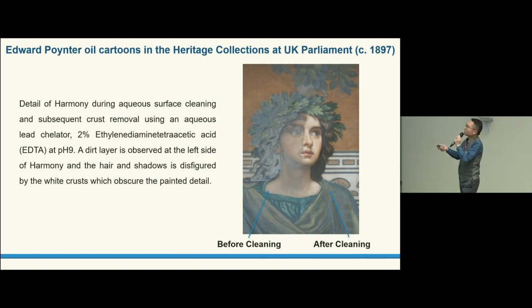Because we have identified the main components in the white crust, we reported to the conservator, and they use 2% EDTA. It is a lead and calcium chelator. So they apply this EDTA on the surface of the painting and then wash away the white crust.